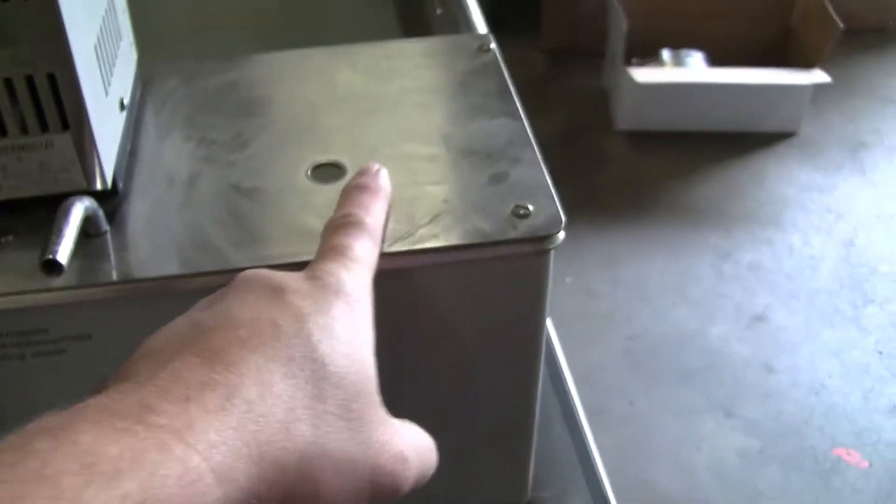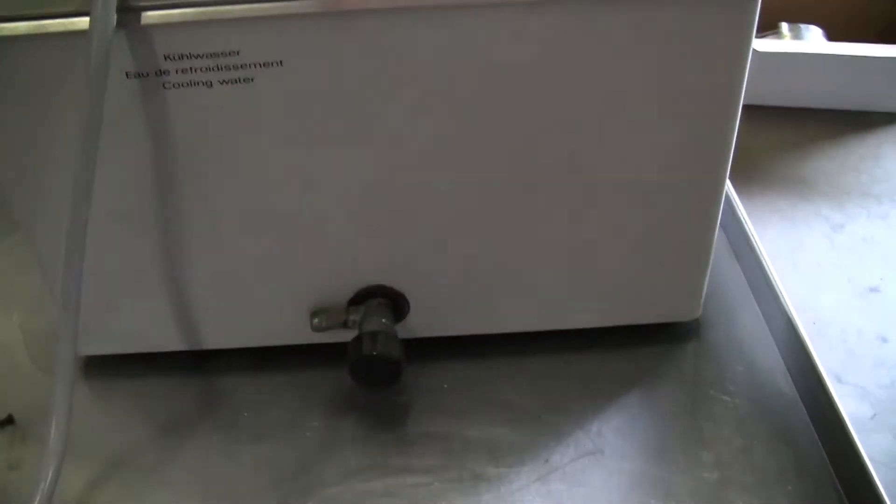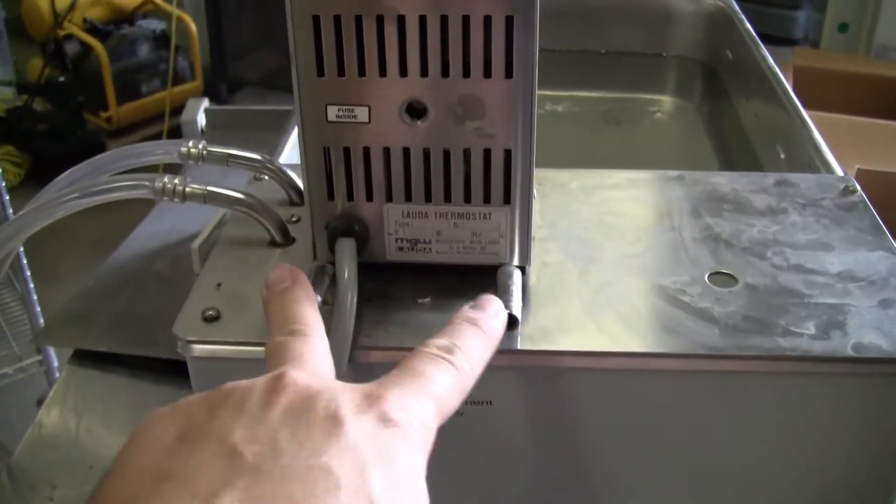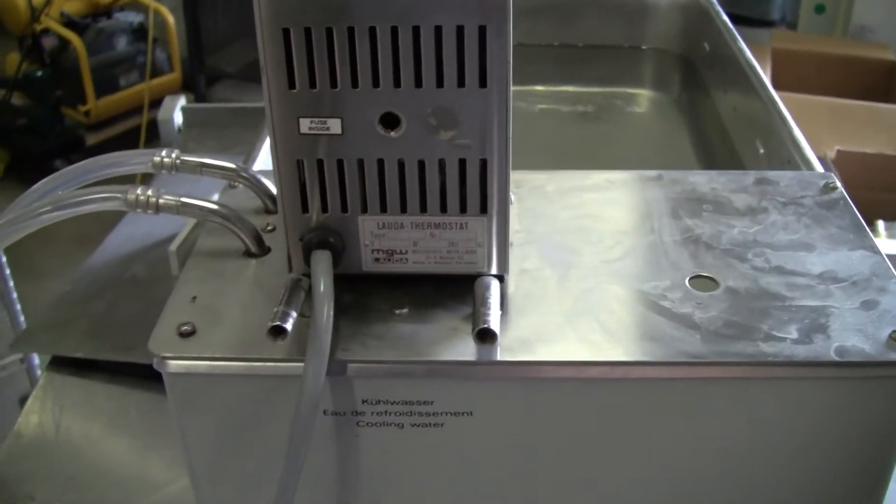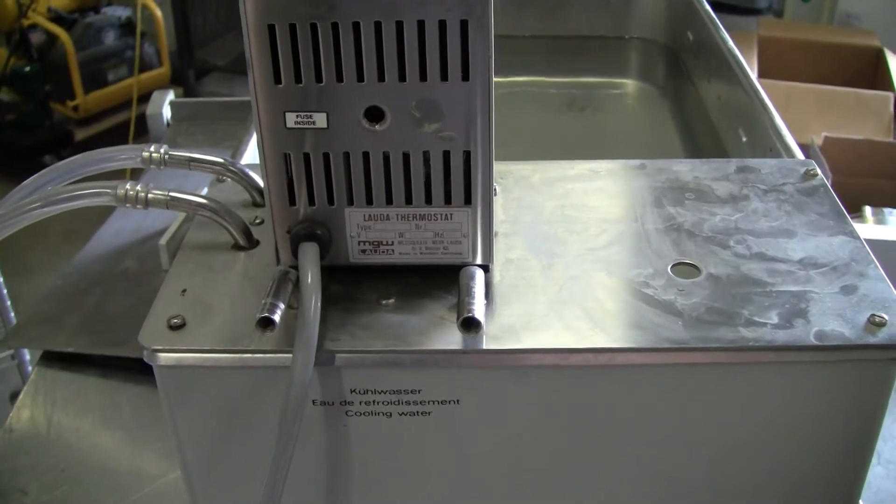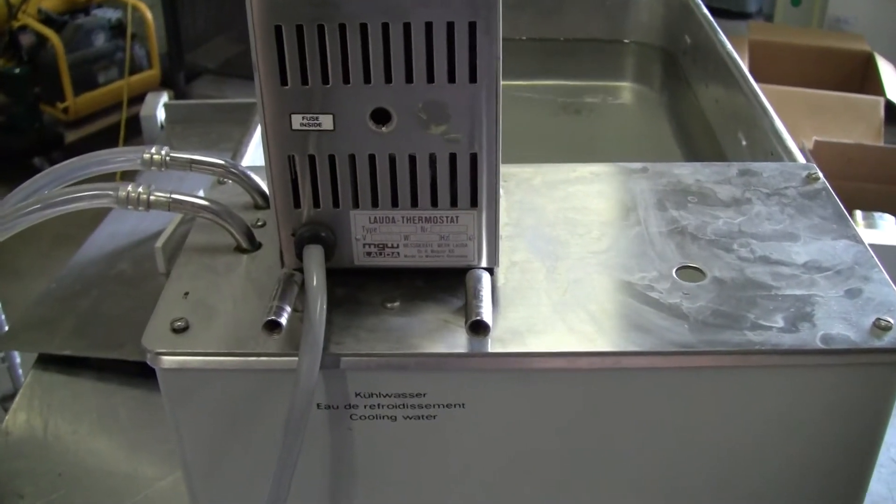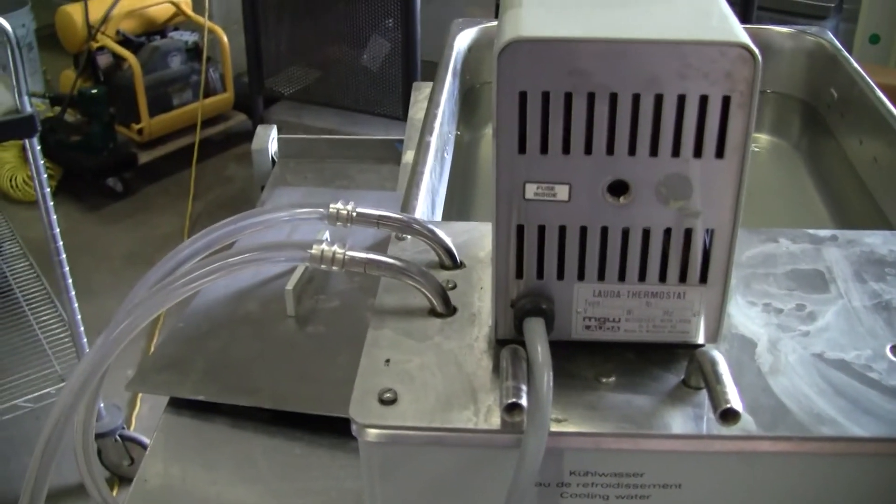Thermocouple or temperature port. It's got a bottom drain. This is an external input that could be used. And there's your recirculation loop.